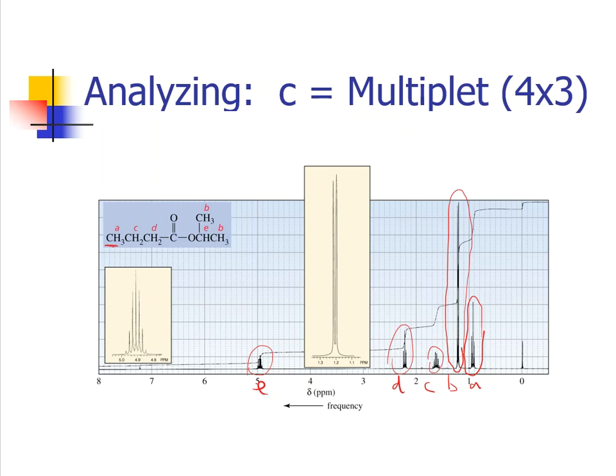So those 2 protons plus that mean parent, that will be a total of 3. So if you look at that particular signal, you can kind of see 3. They did not really blow that up for you. They just left it little bitty tiny things, and you got to squint your eyes to see if it's actually a triplet. But you can at least see 3 major pieces there.